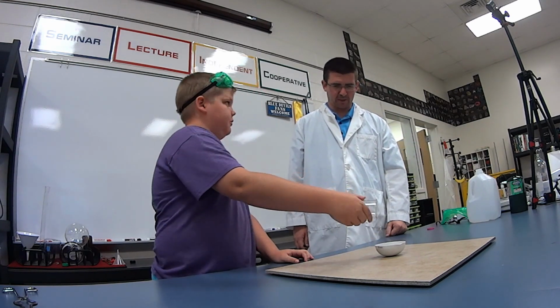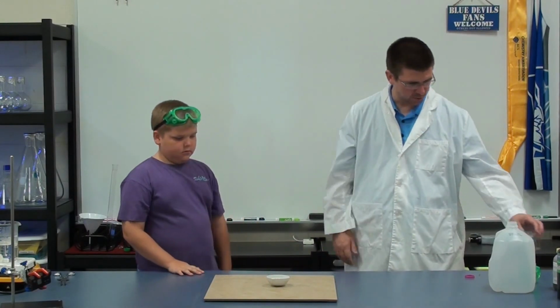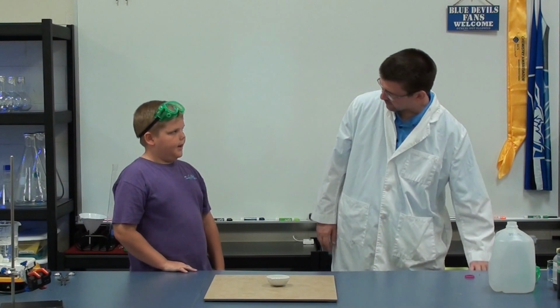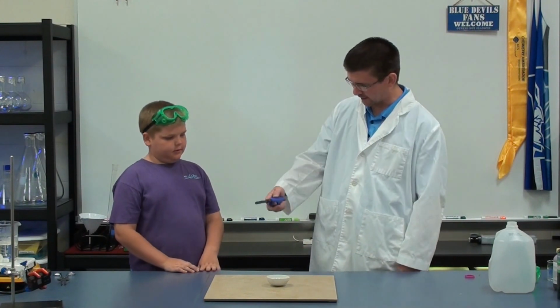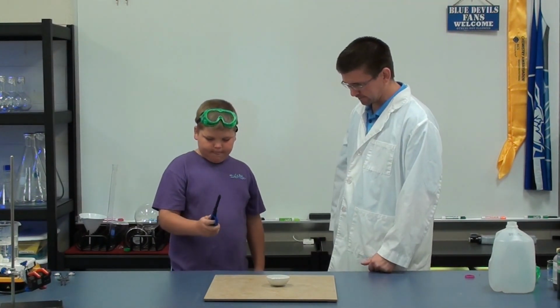All of it, or just? Yeah, just pour it in. That's good. Okay, so if I light that alcohol now, what's going to happen to it? It's gonna burn, but it's gonna go right back out. What do you mean it's going to go back out? You mean the fire won't last long? No, it won't last long. Okay, well go ahead and light that for just, you know how to use that, right? Just click it and light our alcohol there.